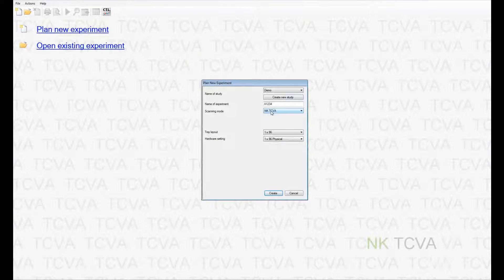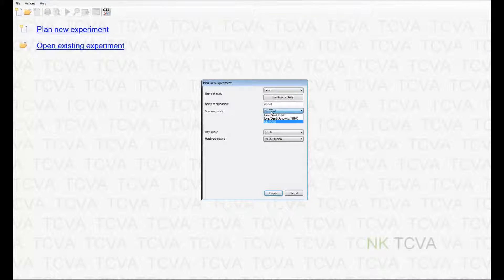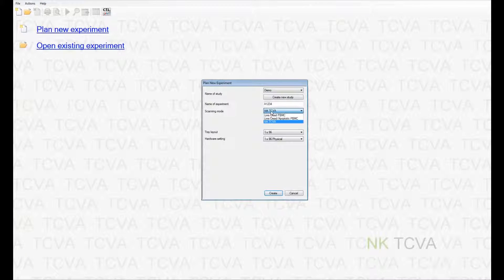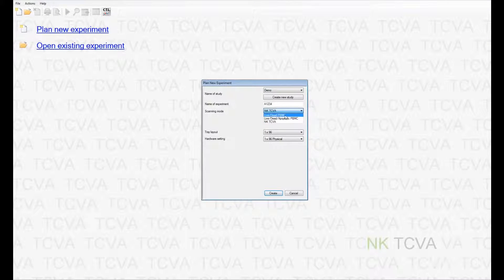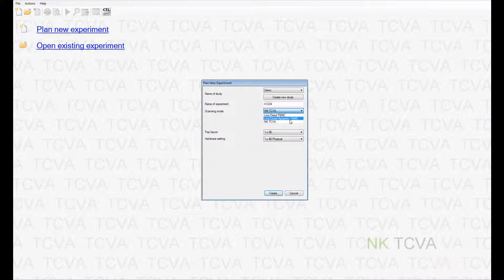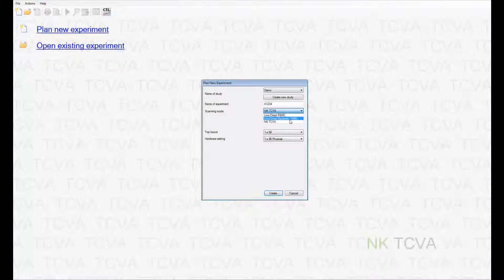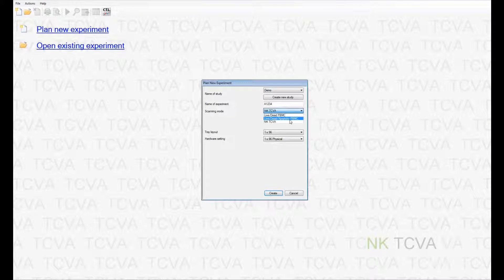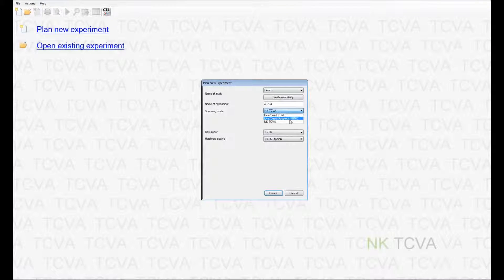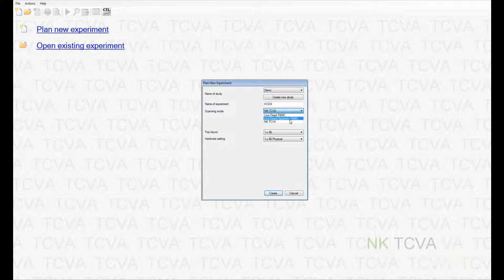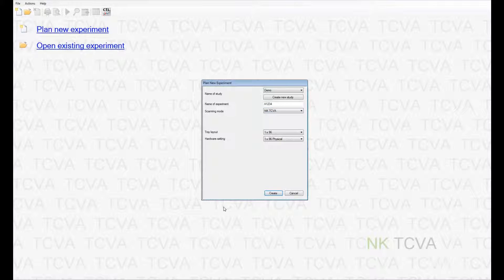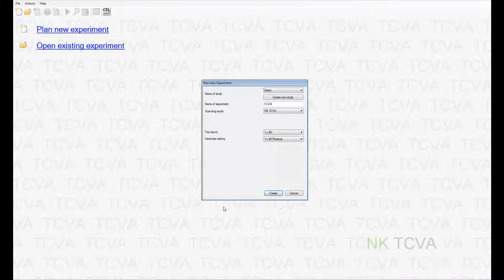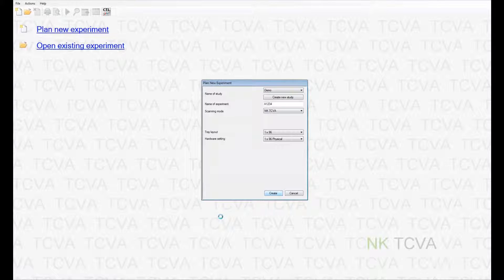The CTL cell counting software also has the capability to determine the viability of a PBMC sample by counting either live and dead cell numbers within a sample or detecting live, dead and apoptotic cell numbers within a PBMC cell sample. To learn more about viability detection, please visit our website for more information on the CTL live dead apoptotic application. After loading these basic parameters, you are ready to create the experiment.